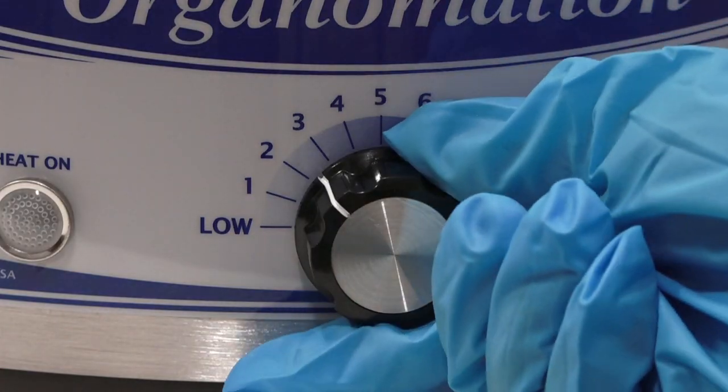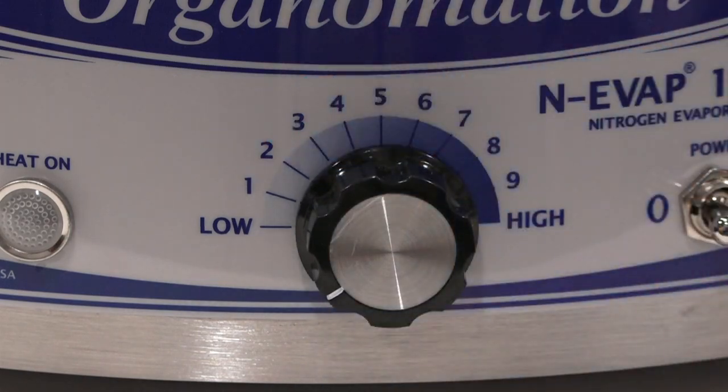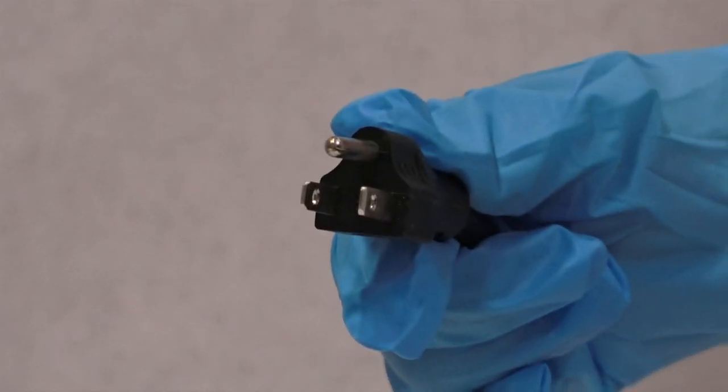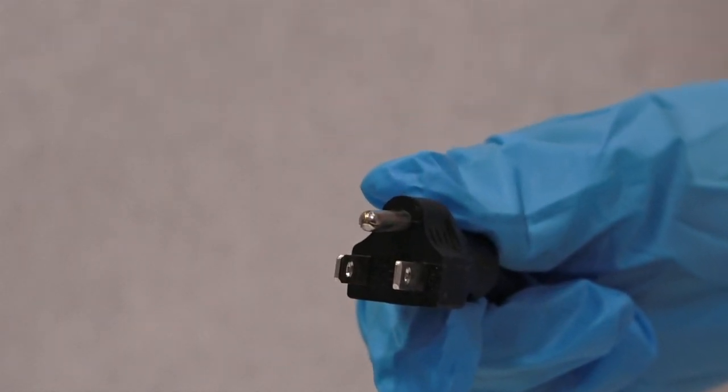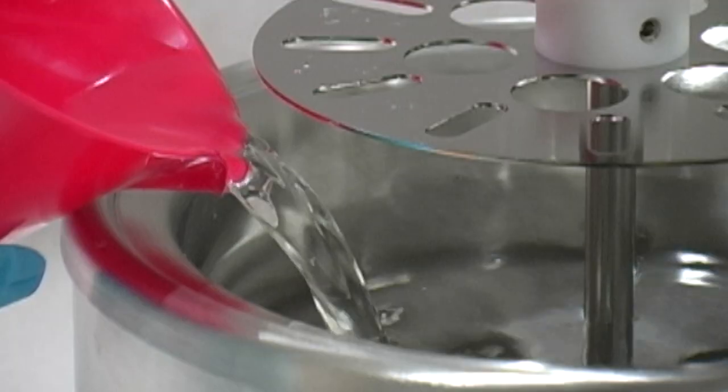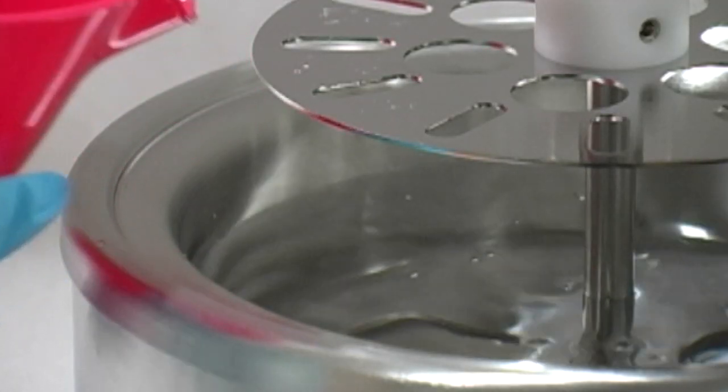Turn the bath thermostat knob to its lowest position. Plug the bath's electrical cord into a three wire grounded electrical outlet. Fill the bath with water to within a half an inch of the bathroom.